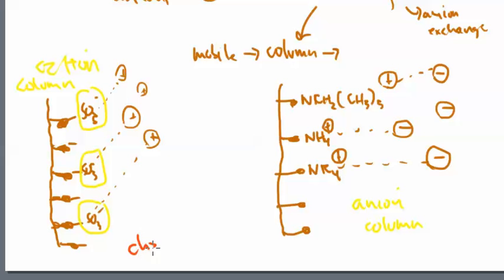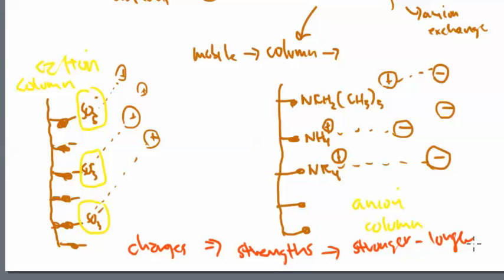We're looking at charges, and these charges are very important because all of the amino acids will have different strengths. The stronger that they are, the longer that they stay in the column. And this is what gives me the separation. So if I'm looking at these charges, the more charged that they are, or the more polar that they are, the more they hang out with the stationary phase most of the time, and the longer that they stay in the column, well, other things that race through the column can come out first. And this is what gives me my separation within the field of ion chromatography.